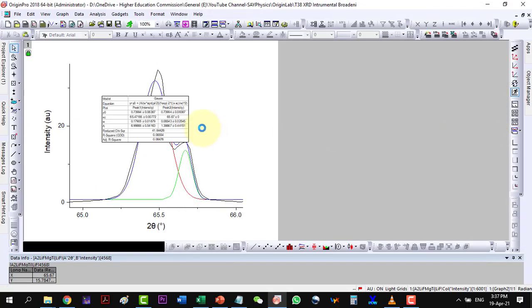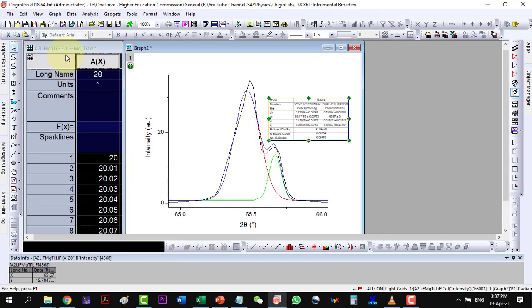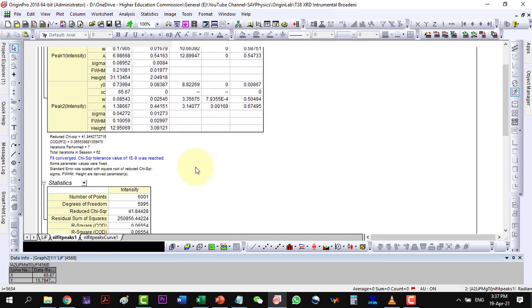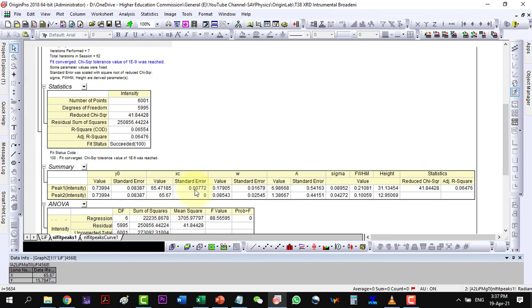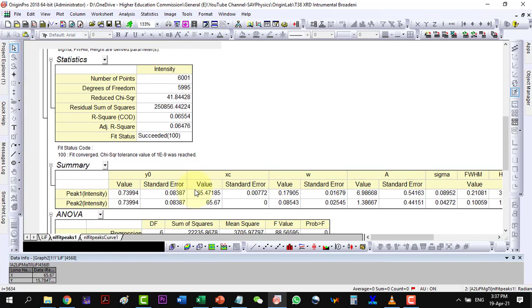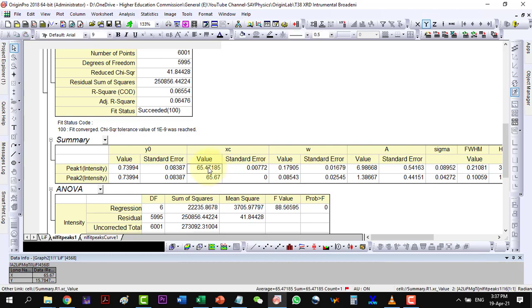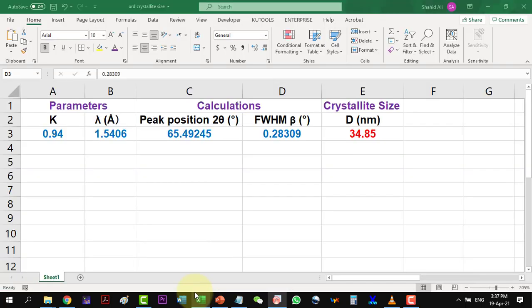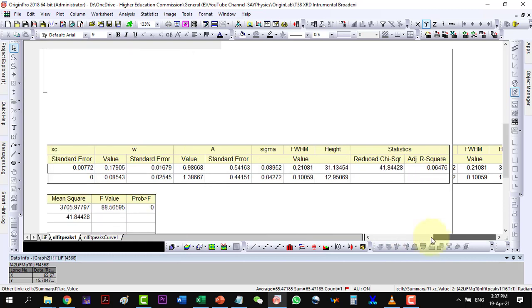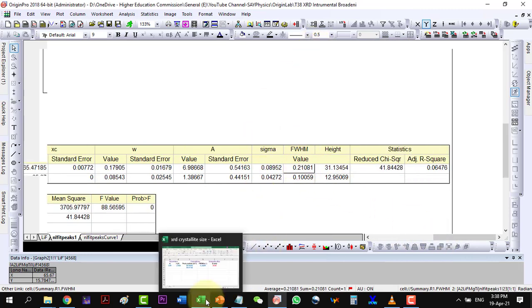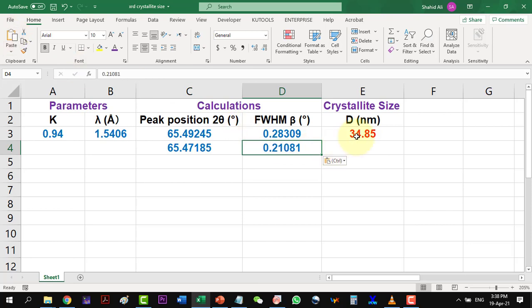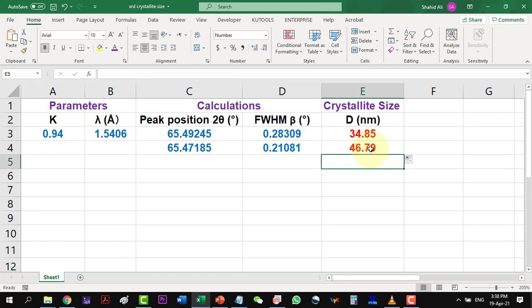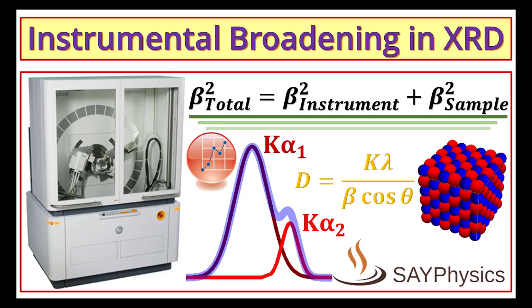Now click OK and go to the data. Here the position of peak has changed slightly. Let me copy the values to the Excel file. And here I see that the crystallite size has increased by more than 10 nanometer. So this way we can subtract the overlap caused by the Kα2 peak from Kα1 peak for accurate deduction of the parameters.